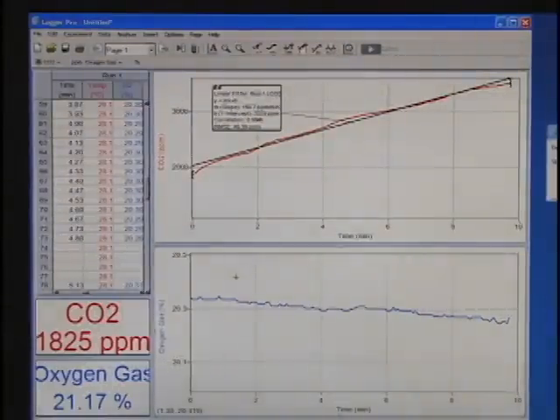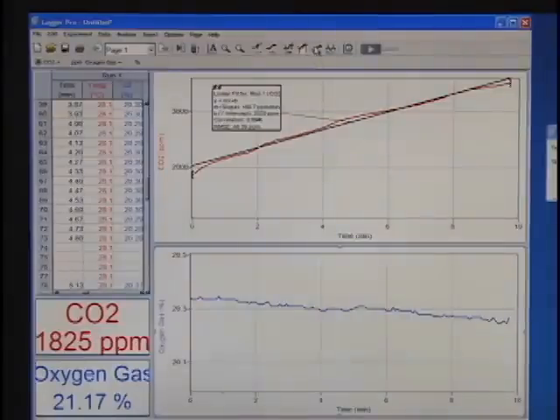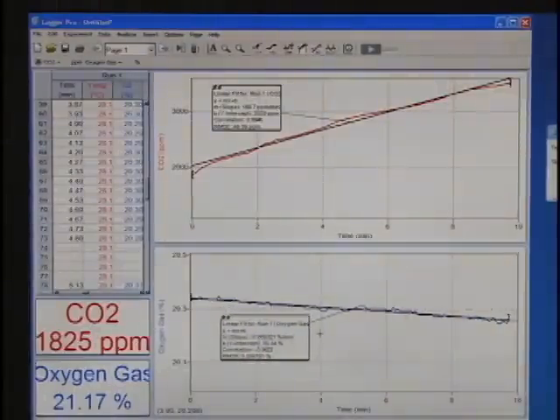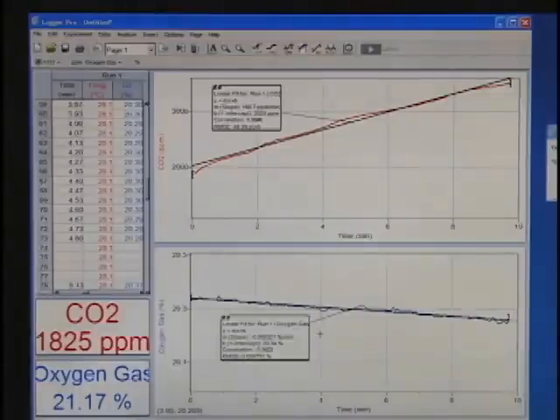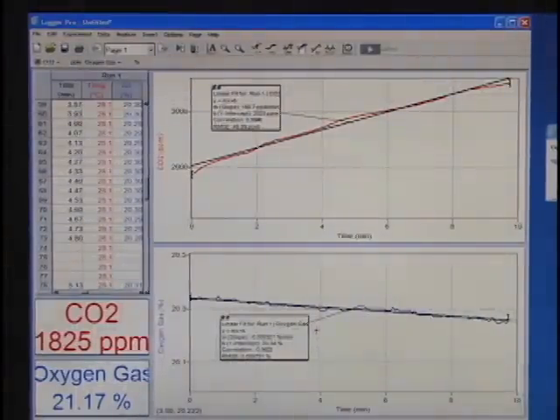Similarly, repeat this process for the oxygen gas graph. As you can see, the graphs clearly indicate that carbon dioxide is being produced and oxygen is being consumed while the peas are in the respiration chamber.